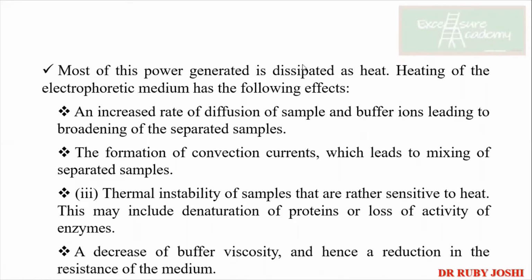What does this mean? What do you mean by diffusion of the sample? I would have taken the image actually. So what happens is that in the gel, if heat is being generated, you have loaded the sample in the wells, okay? So what will happen to this sample? Usually if everything is going in ideal condition, there is no heat generation. So when it is moving, you will see a single band moving like this. But if heat is generated, then there is a diffusion of the sample.